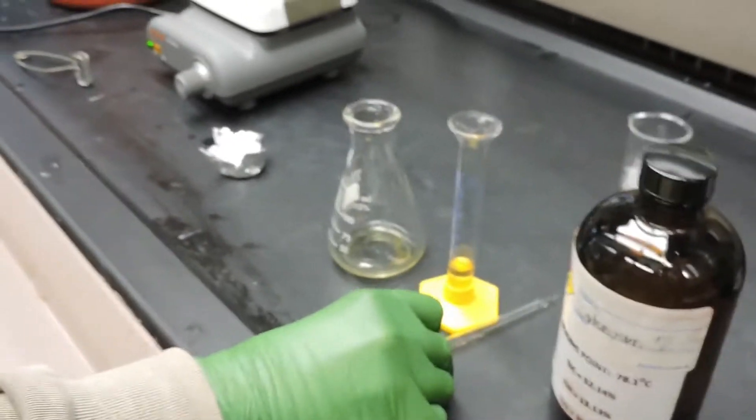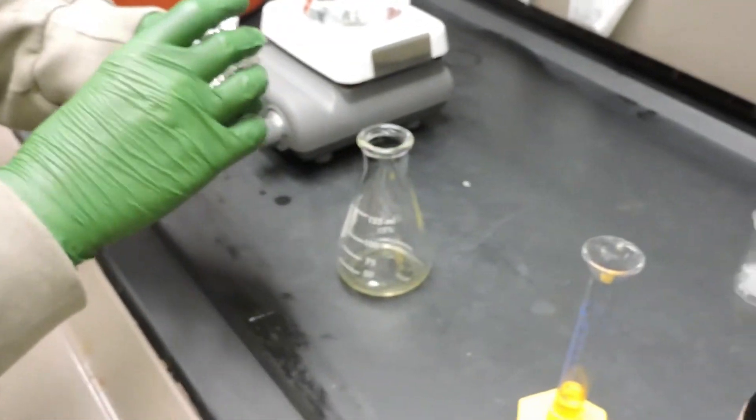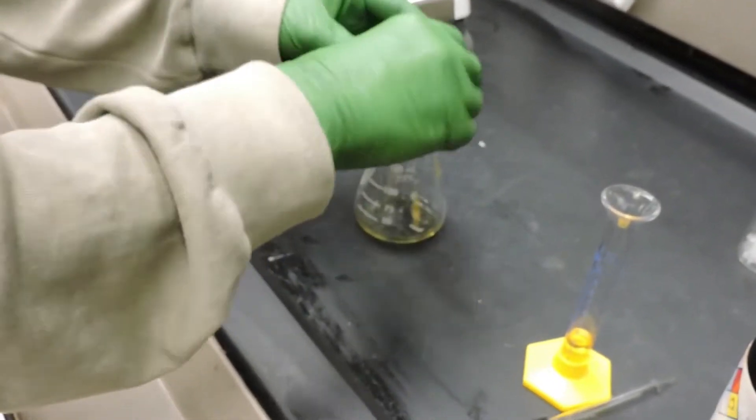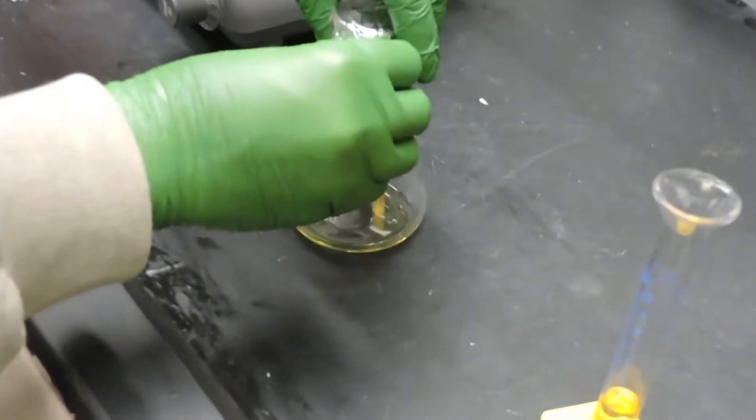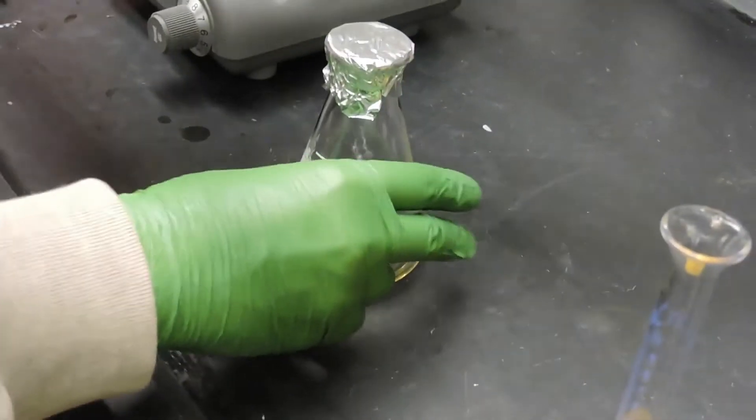Now that the unknown liquid is in the flask, we'll cover it with our aluminum foil and poke a hole in the top to release excess vapor as we heat it in our hot water bath.